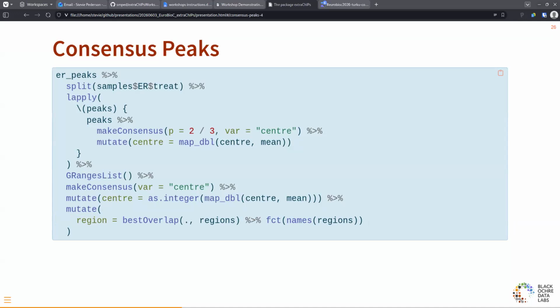So now we've got peaks and we know whether they're in a promoter. We know whether they're in a gene body. We know whether they're miles away from a gene. We could put any other regions we want as well. We could have got some enhancers from ENCODE or something and put them there, and whatever features you want to do, you can just put them in.